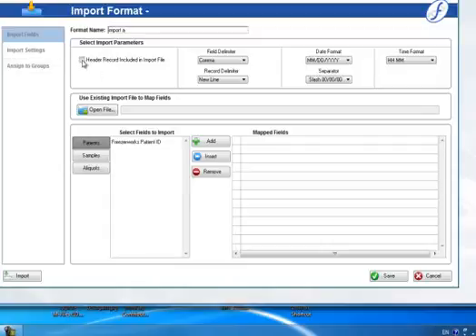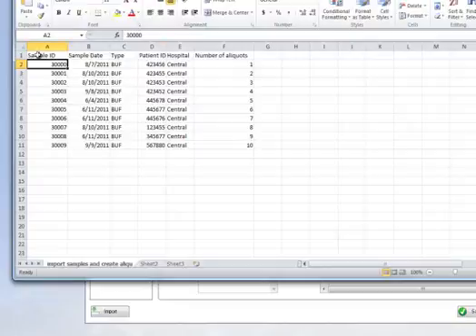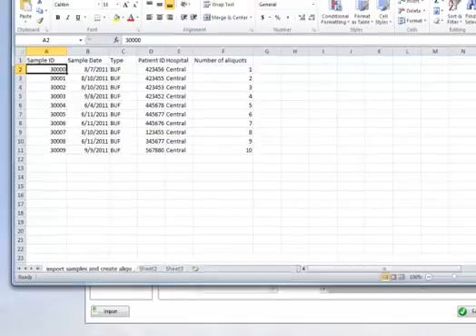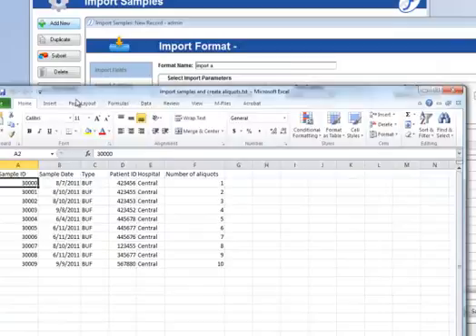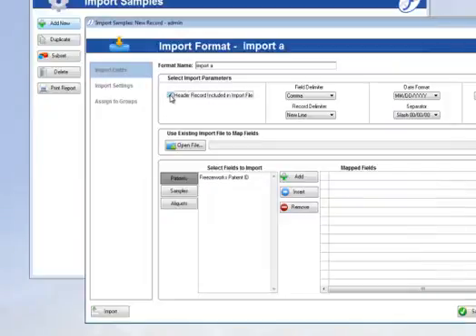First, is there a header record included in this import file? And to go back here, here's our header record. Freezerworks wants to know whether it should ignore the first record or try to import it. Since it's a header file, we want to ignore it. So let's go ahead and select here that there is indeed a header file.